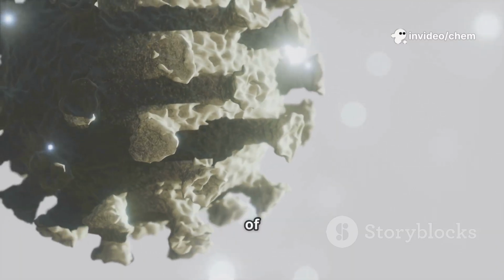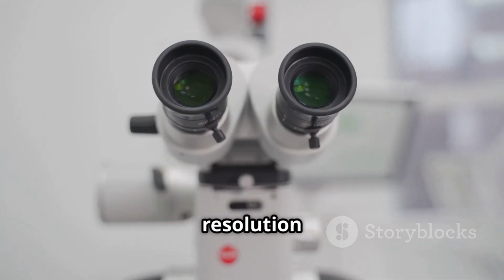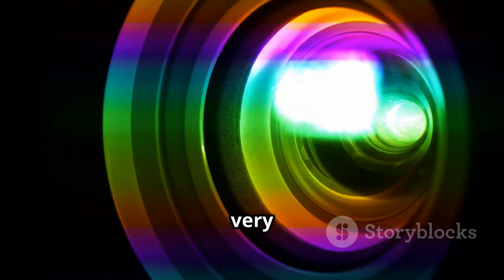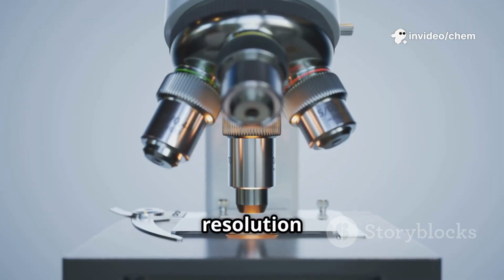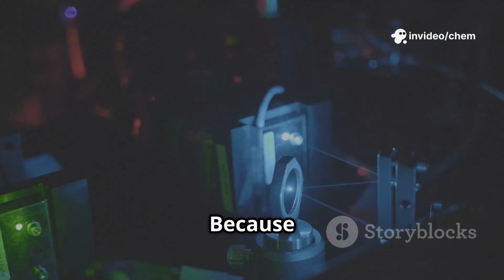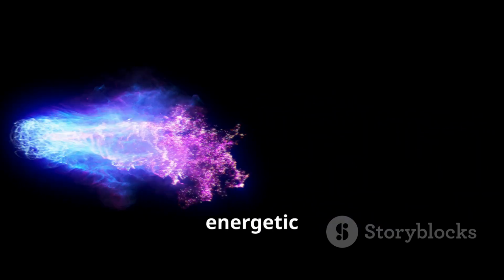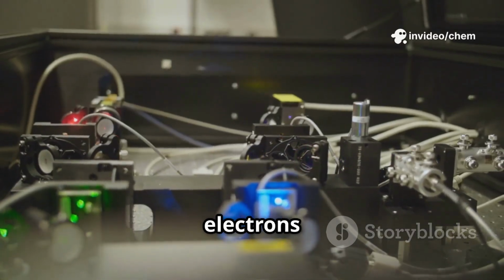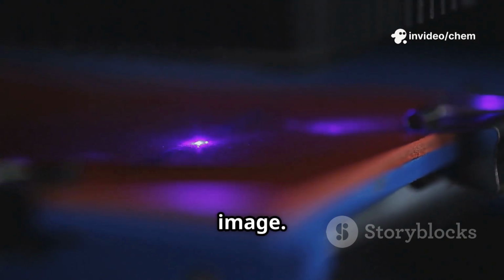Surface investigation of materials can be achieved through both microscopes. However, the resolution of optical microscope is very limited by diffraction properties. Instead, a much higher resolution data can be attained using electron microscopic methods. Because electrons have shorter wavelength than visible light and are more energetic than visible light photons, a beam of highly accelerated electrons are focused on the surface of materials, creating the image.